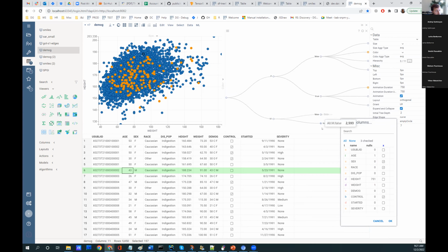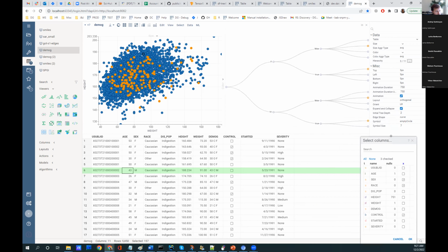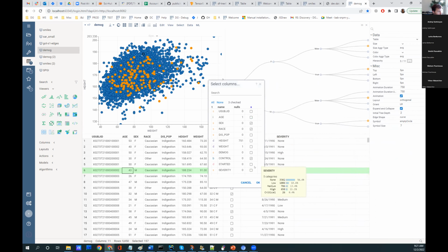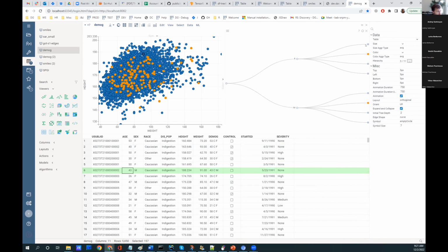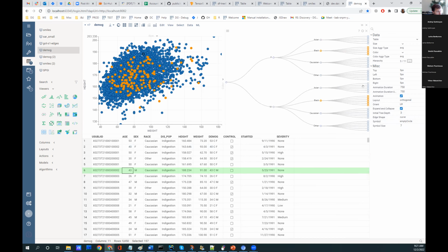But this is just the default way of visualizing it. If we want to, we can change it on the fly, and let's introduce the DCs. So yeah, now we actually see all information, all categorical information, including the DCs.